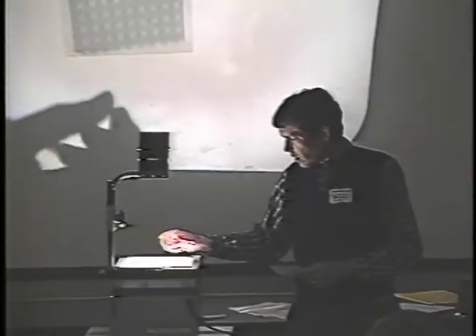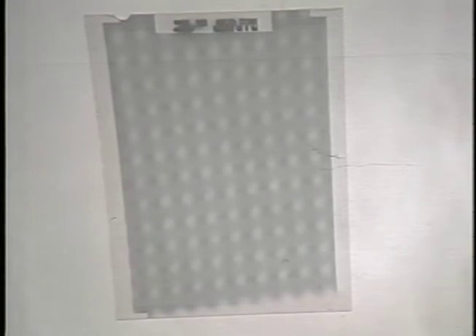This is a spot scan image, just so you know what I'm talking about, where the beam is focused down to a spot that's around 1,000 angstrom diameter. Of course, it's easy to get a smaller spot than that, but this is still under conditions where we're getting good phase contrast imaging. This is actually done with a condenser aperture of about 30 or probably 50 micron diameter, so it's a fairly small condenser aperture. So it's a coherent beam focused into a fairly small spot. Now, at 400 kV, we can focus down to a much smaller spot than this.